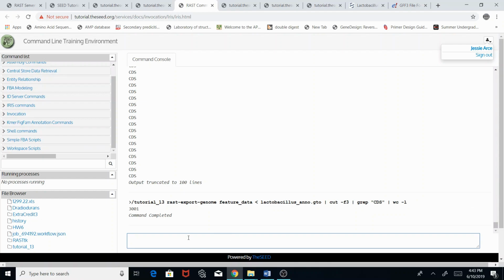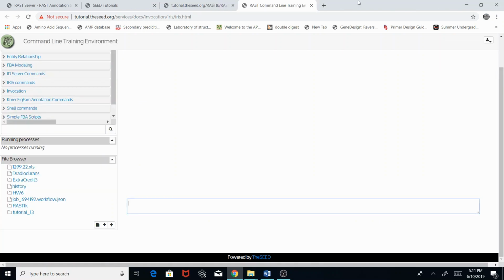And obviously you could just go in one go, export RAST, export genome, and type everything you need all in one go. Just remember, all I did was break it down step by step. It would go by quicker once you already know and get familiarized with the commands and what they can do.